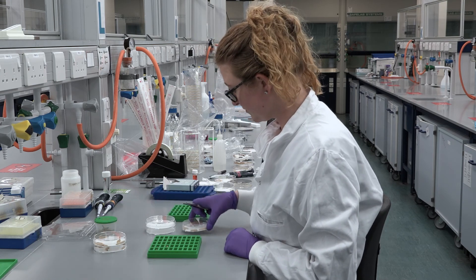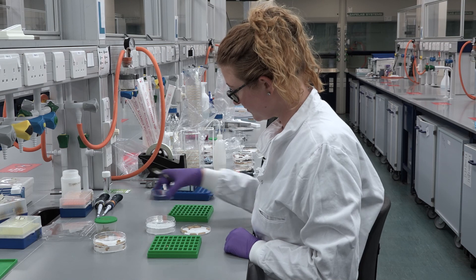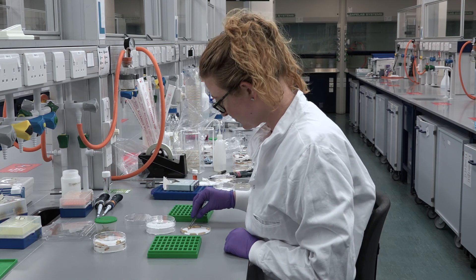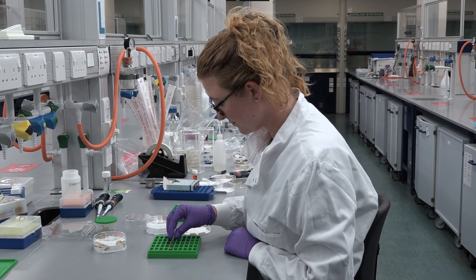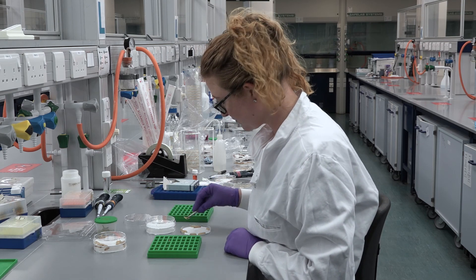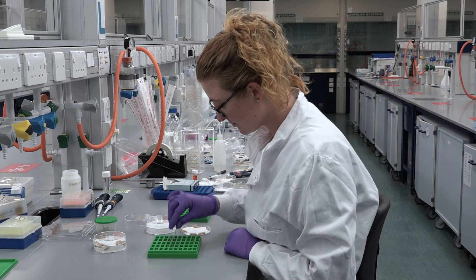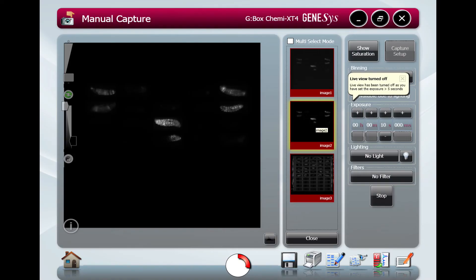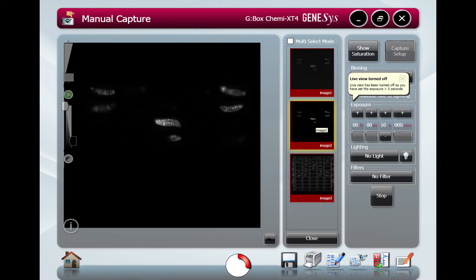When imaging the larvae you start by taking your bioluminescence images. We use a defined exposure time of 10 seconds and 300 seconds. You can see from these images that we have detected bioluminescent bacteria within the larvae.